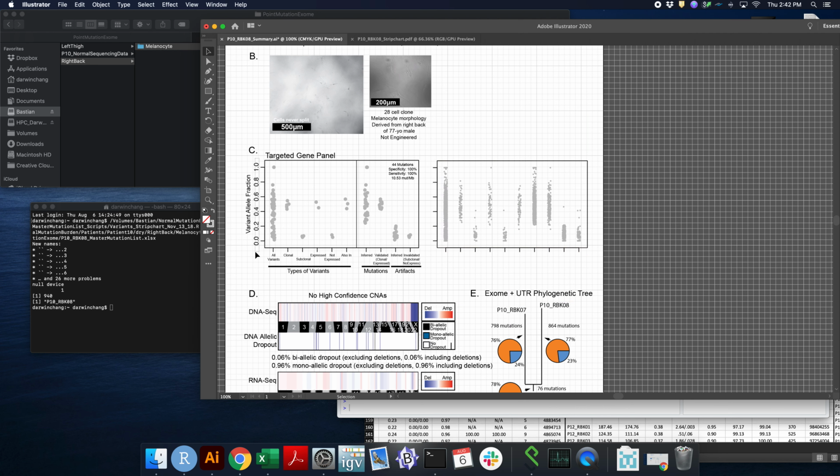Take the y-axis values and the x-axis values, and copy and paste them. If you do not already have a targeted gene panel there, you can simply copy from an existing template.